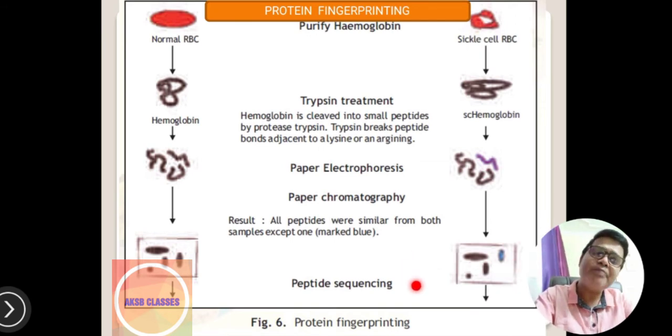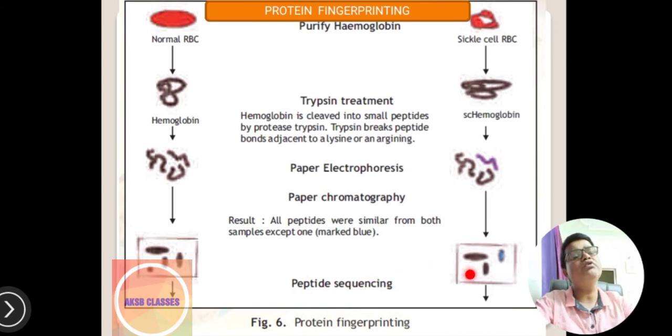Then we put the sample inside the mass spectrometer, that is MALDI-TOF. It is a technique through which we find out the protein's amino acid level with the reference compound of the protein, through which we can match the amino acid sequence. What is the percentage of matching? On that basis we try to predict the structure, the function, and the helical pattern, whether alpha helix or beta pleated structure, in that unknown protein sample.